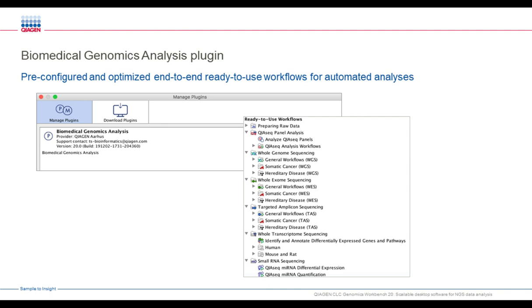Going into depth with the biomedical clinical genomics analysis plugin — if you're working with mouse, rat, or human, this plugin has a lot of workflows that are standard in the field for oncology and for hereditary workflows. You can see family-of-three, family-of-four, and so on. For somatic oncology, there are tumor-normal sample workflows, each slightly different in what they use for variant calling and filtering, specific to the purpose at hand.